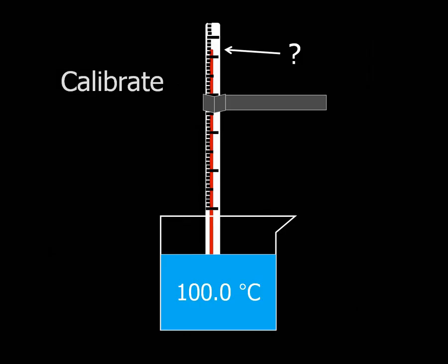All right, so calibration involves putting your thermometer, using the thermometer clamp, into a beaker containing deionized water and a small pinch of boiling chips, just to make it boil more evenly. And assuming that the water is boiling at 100.0 degrees, we want to know what your thermometer is reading the temperature to be. So let's say, for example, that the temperature of this water, as read by the thermometer, is 102.0 degrees. So clearly there's a discrepancy.